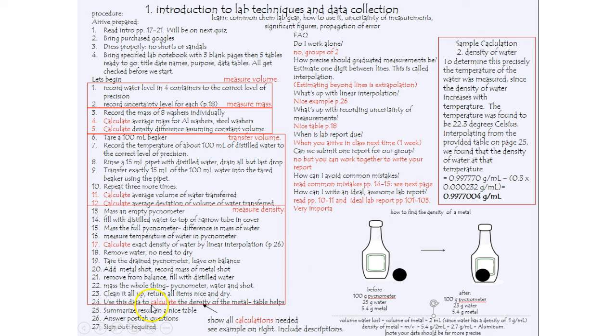We can summarize these results in a nice table. Don't forget to answer those post-lab questions. I always get a few students who don't. That's worth a separate 5 points. Make sure you get each page of your laboratory notebook signed. I'll usually ask you to help clean up. Typically the balances get a little messy. And once that's completed, you are good to go.